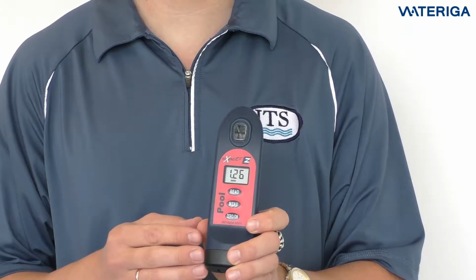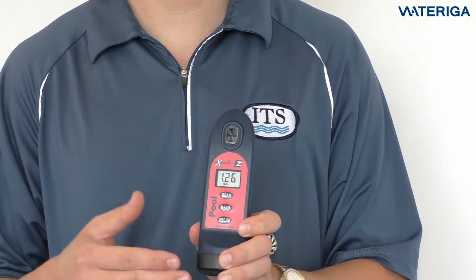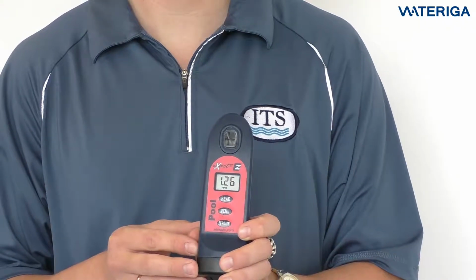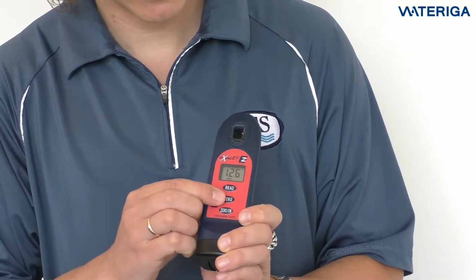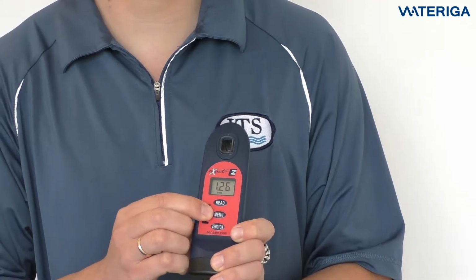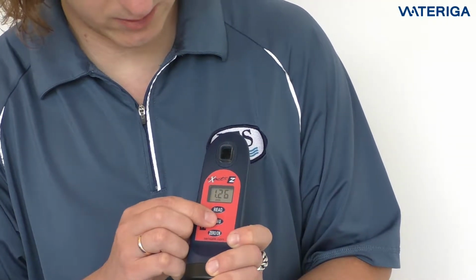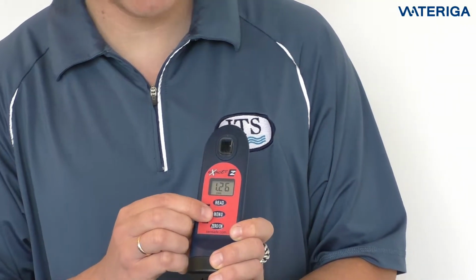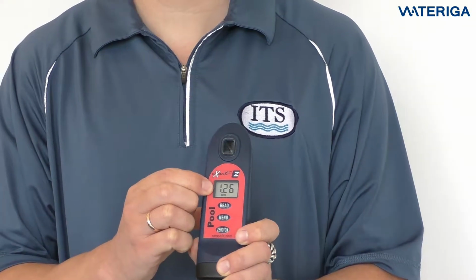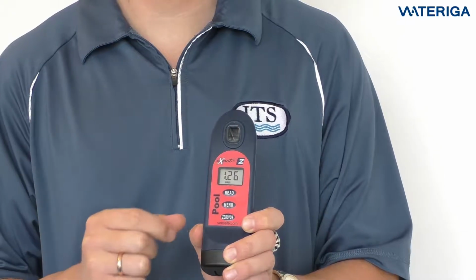The Pool eXact Easy photometer also has a memory. For each of the menus in the memory of the Pool eXact Easy, there are 20 slots for memory. So if we want to see the memory, we need to select the menu button and find the menu that we want to see the memory in. So let's say we're going to find the chlorine readings that we just did. So we're going to find the CL3 menu, which we just showed there for a second, which means we are now in the chlorine menu.